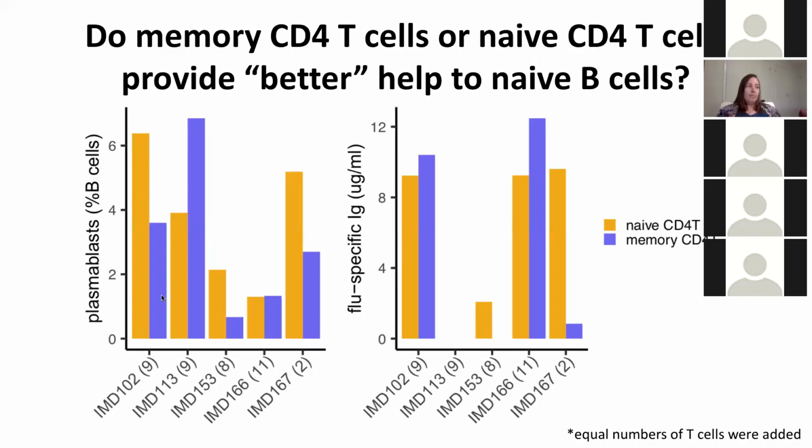Lisa, how did you isolate the memory CD4 cells? Is this flow using specific memory cell markers? Yeah, so this is all with sorting, and generally we would use CD45RA and CD27 to isolate naive versus non-naive cells.